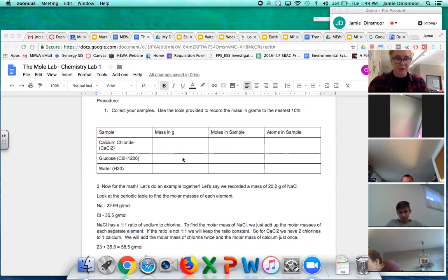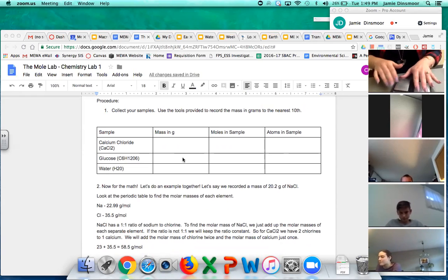It's going to be completely arbitrary here. I'm going to tilt my camera down so you guys can see my scale. So here's my digital scale. I personally like to use digital scales because I'm lazy and triple beam balances are really hard. You might be able to see, unless it's upside down for you, that the scale is zeroed. It says 0.0.